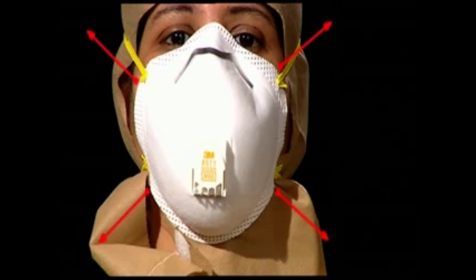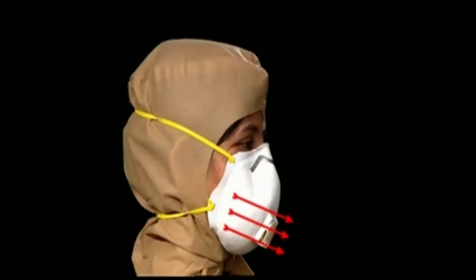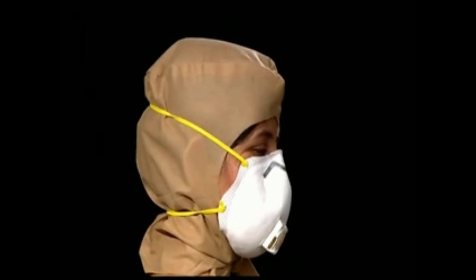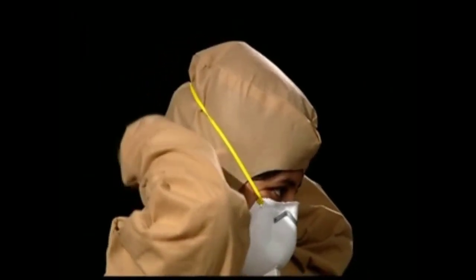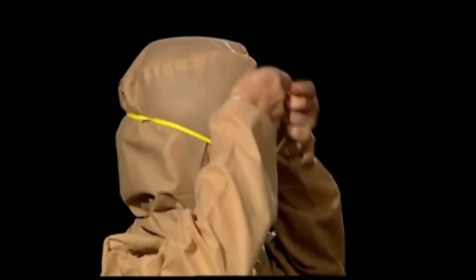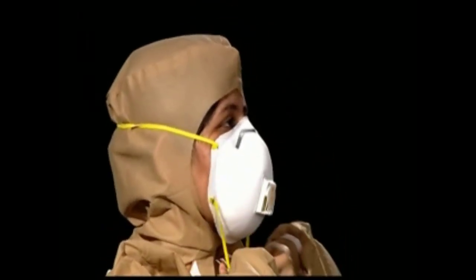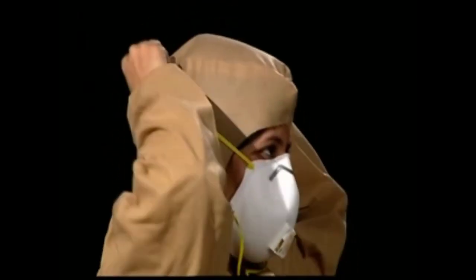In the case of the N95 respirator mask, roll your fingers beneath the band of the respirator and remove the lower strap first by bringing it over your head. Follow the same process and get the upper strap over your head. Without touching the frontal area of the mask, discard it into the biohazard bag.